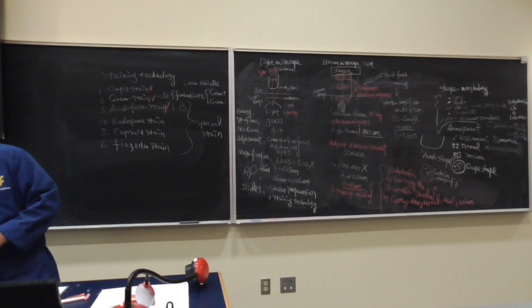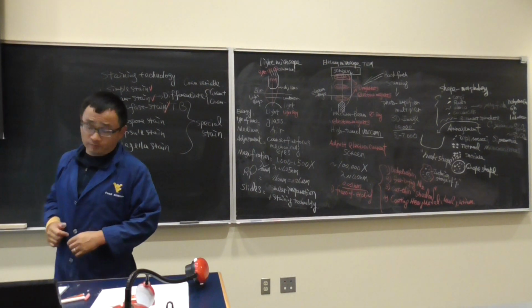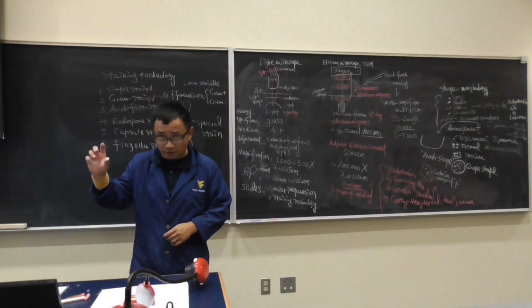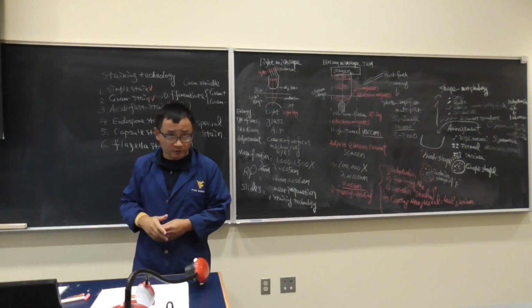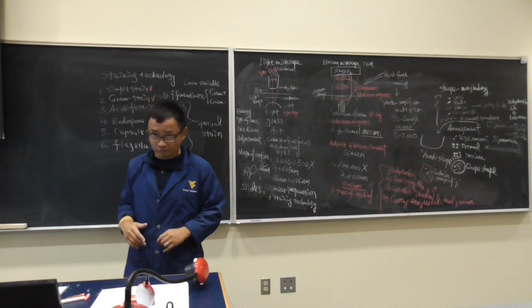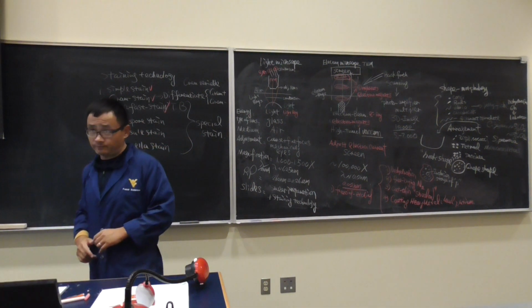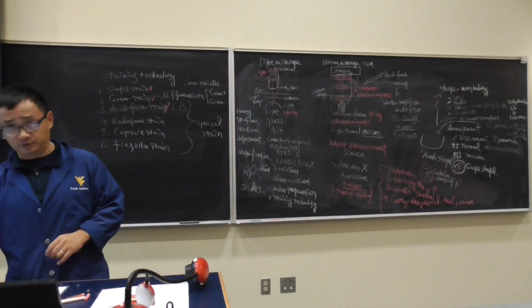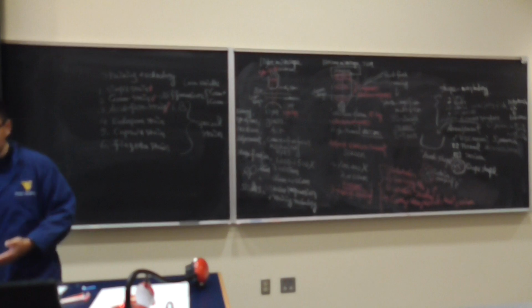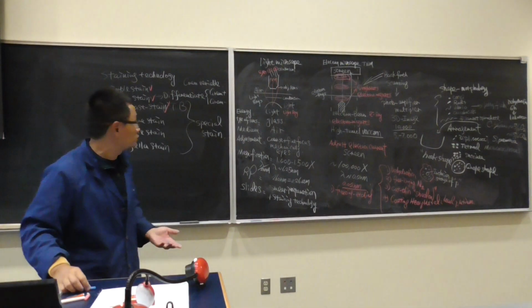Last one, Bacillus. Bacillus is large rods compared to E. coli. E. coli is tiny rods. You have seen it a couple of times already. It's a special simple stain. Bacillus is large rods like a chain. We will do the endospore stain, and you'll see it more clearly on Thursday. Okay? This tells you the shape and arrangement of the bacteria is very important.